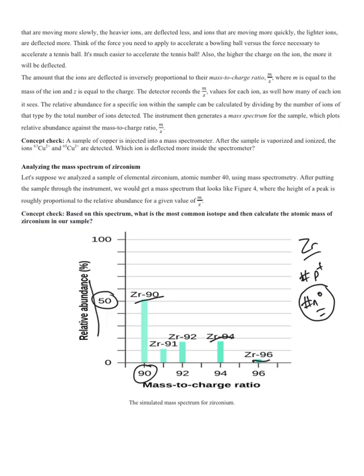Actually, this is incorrect. It really shouldn't say relative because it's a percentage. This is actually a percent abundance. So typically in the graph, you're going to be given the percent abundance of each isotope, how many there are, and what their masses are.